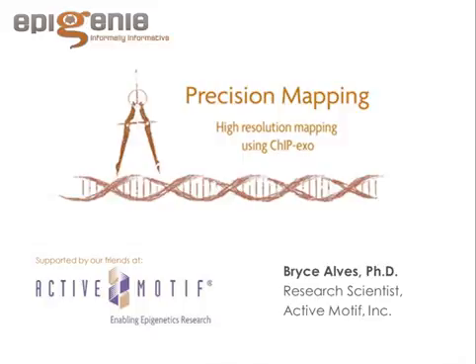No, you definitely get a reduced amount of reads aligning, and many of the ChIP-Exo programs that we looked at had a hard time identifying peaks because the buildup of reads was so small.